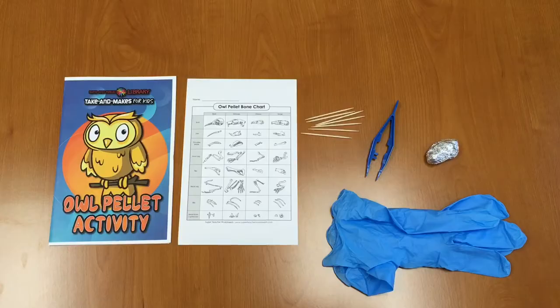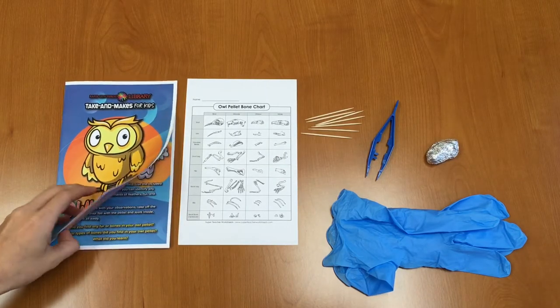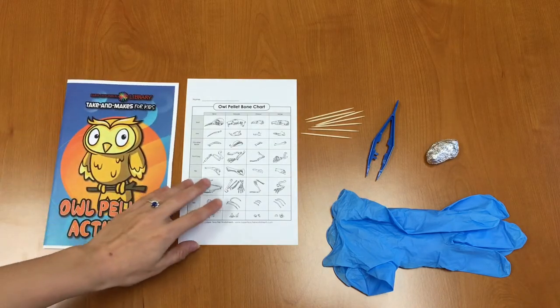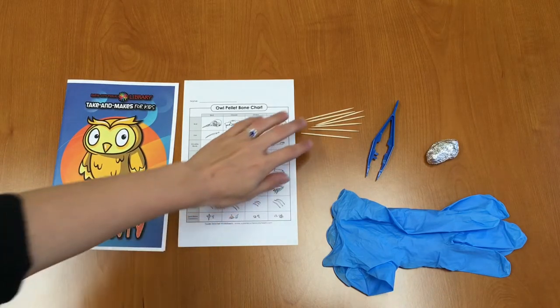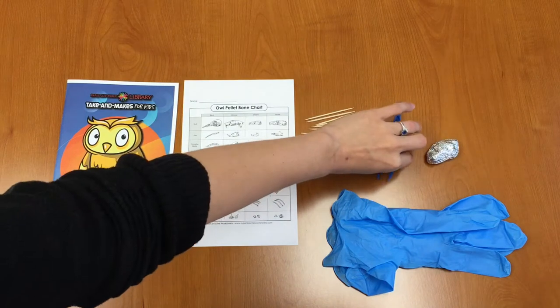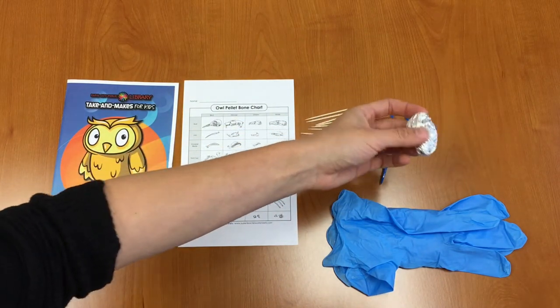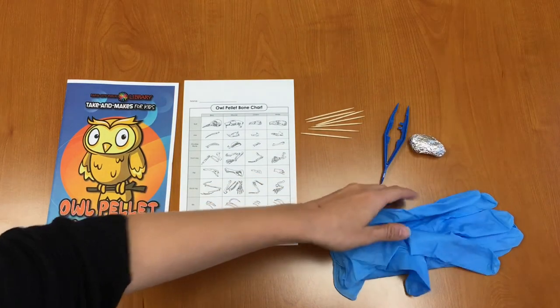Let's go ahead and get started and take a look at what you have in your Take-Me Kit. In your Take-Me Kit you should have an owl pellet activity booklet that tells you what to do and what owl pellets are, a bone chart, some toothpicks, a pair of tweezers, your owl pellet which is wrapped in tinfoil, and your two gloves.